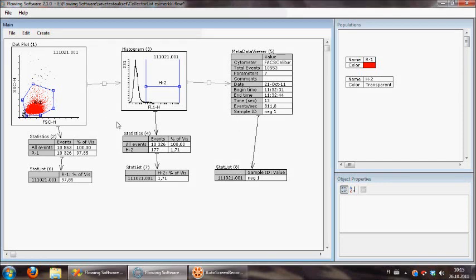Here the user wants different numbers from the same file, and first of all he would like to know the viability of the cells.